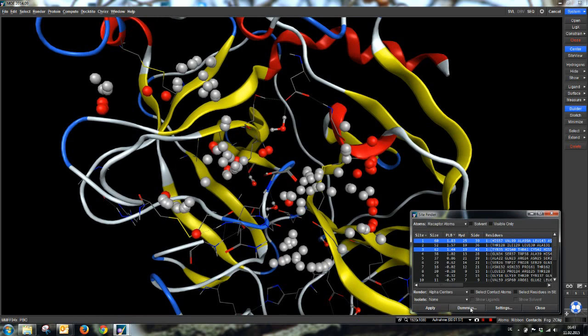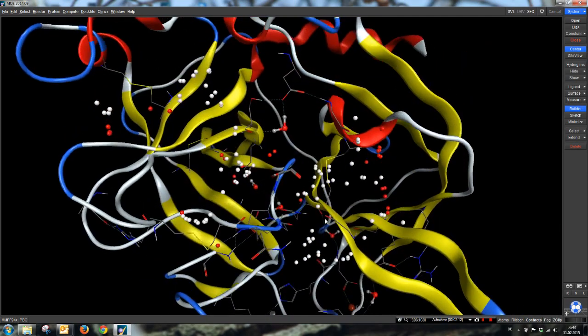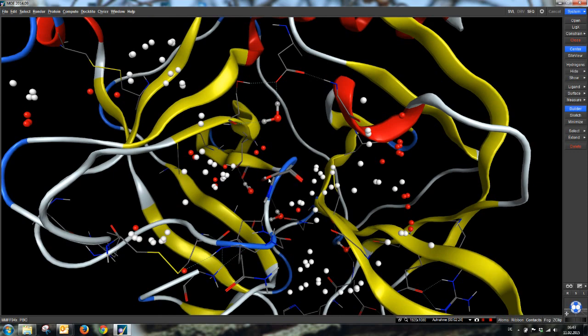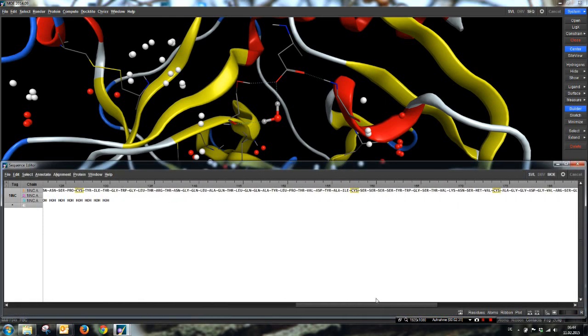And we create dummy atoms by clicking on dummies. Now MOE asks if we want to create dummy atoms at the alpha sphere centers here. We want to do this. Now we can close the Site Finder application and we have our dummy atoms in place. So now we have to delete the nucleophilic residue for the docking purpose and the surrounding, the neighboring atoms.